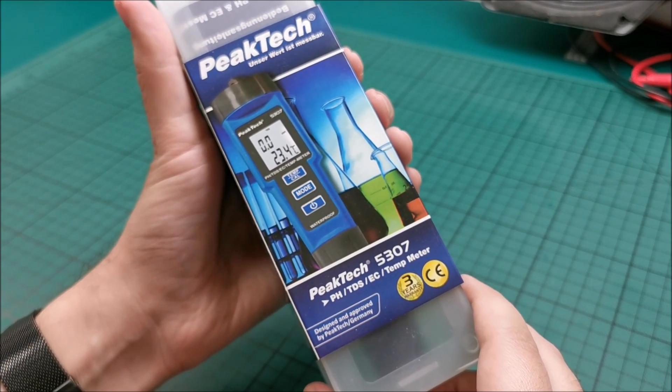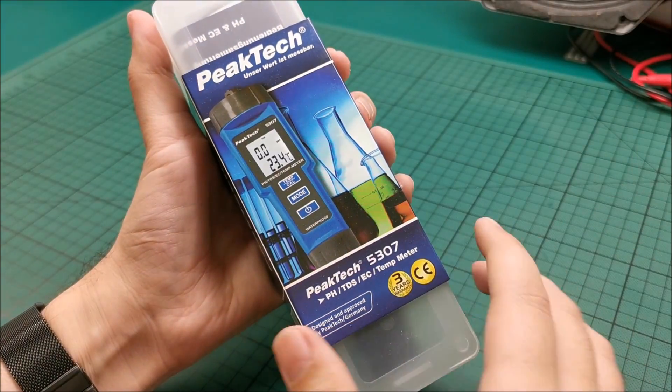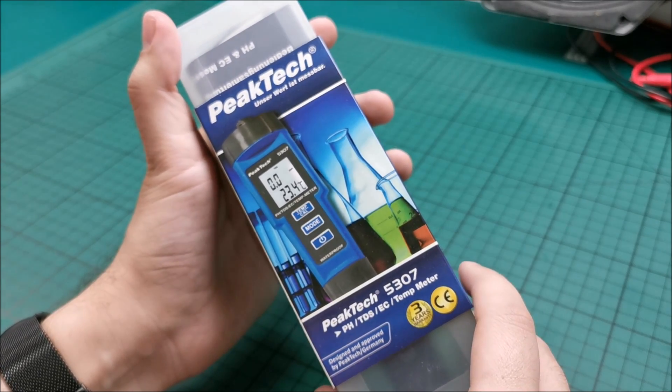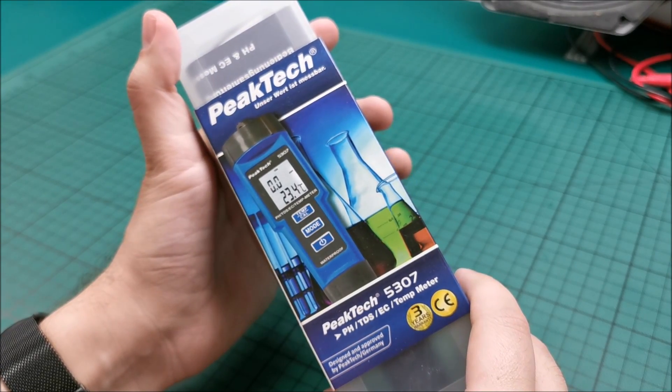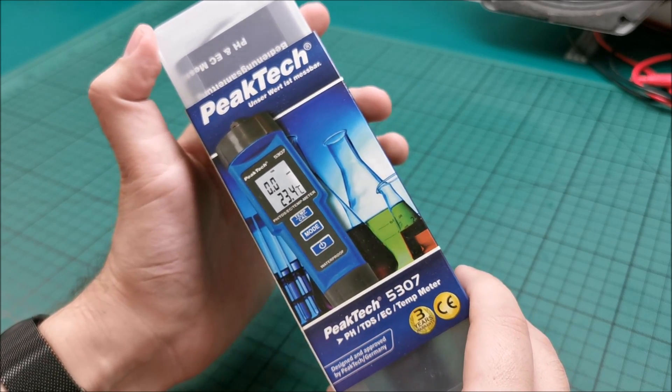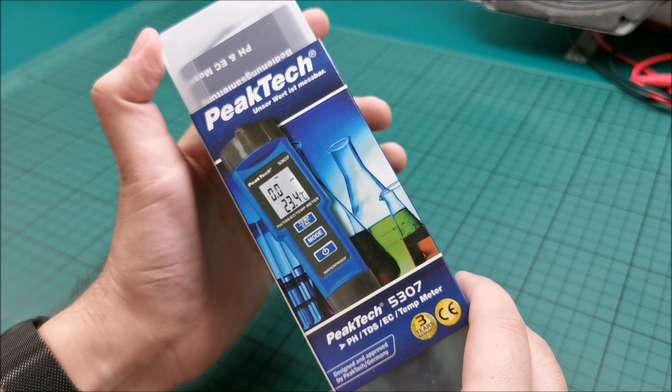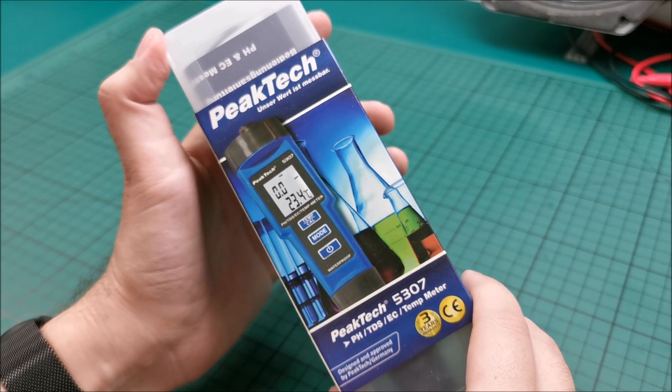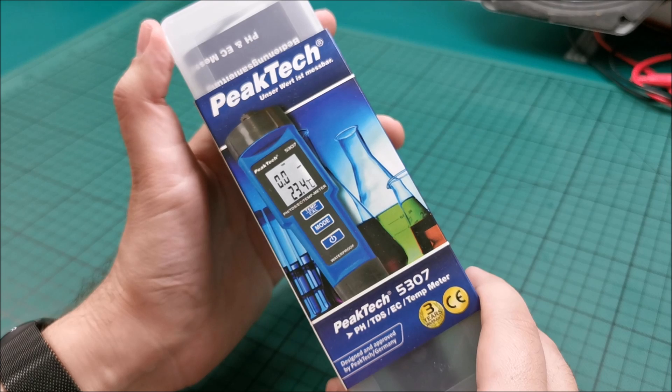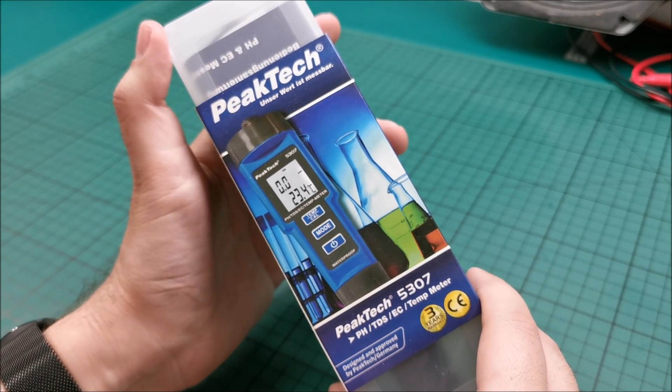I wanted something like this basically for two big and strong reasons. Mine, yours could be completely different. I wanted once to test mineral water that my parents drink a lot compared to standard tap or flat water. I had the impression that it's a bit acidic, but we will see now if my impression was right or wasn't. Because it kind of hurt my tummy a little bit when I drank that thing, so who knows.